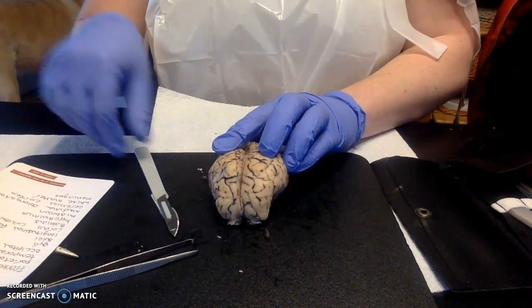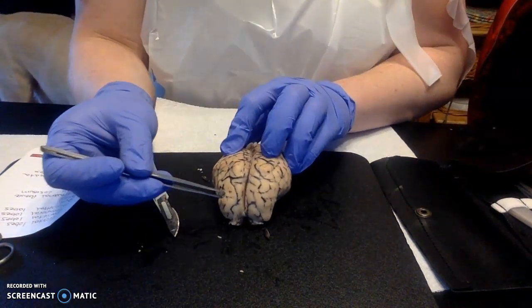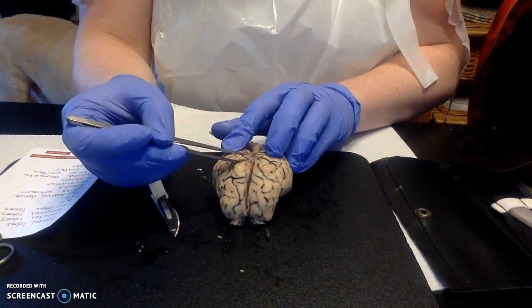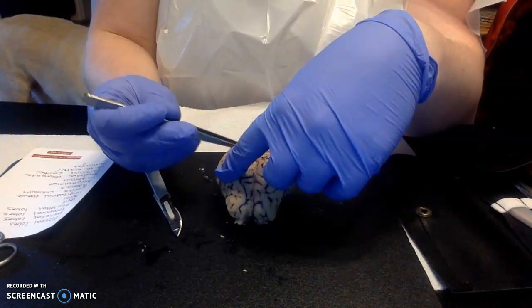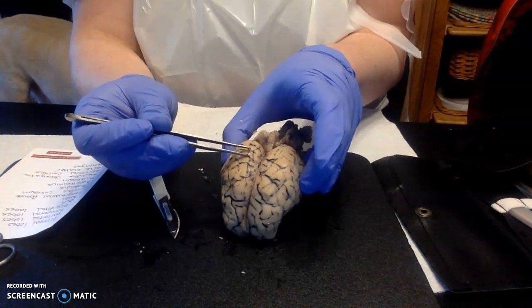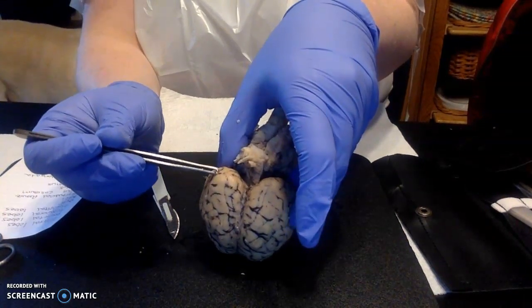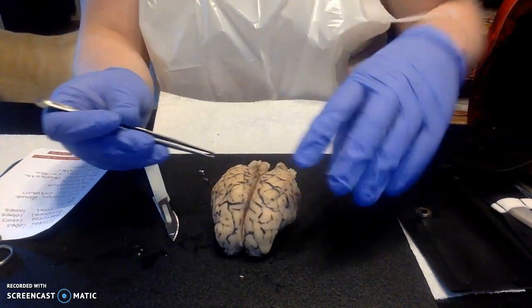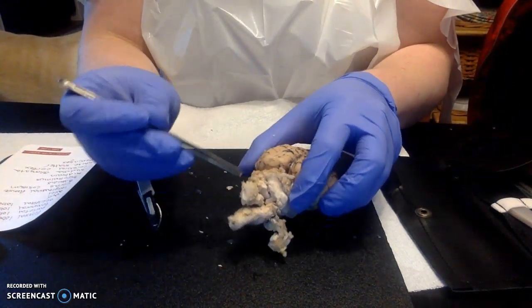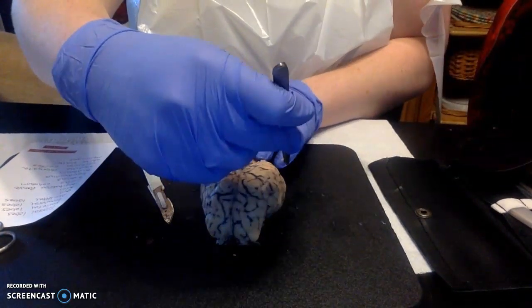The frontal lobes, which is right here. Then we have the longitudinal fissure. Back here, we have the parietal lobes. And down here, it's the occipital lobe. And the cerebellum. It's right here. Got a little mangled. Over here is the temporal lobe.